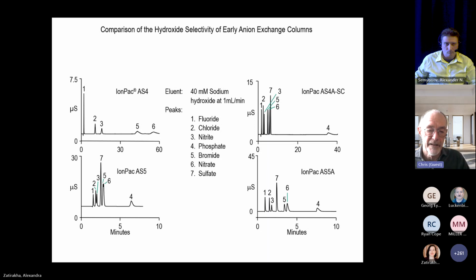And that's because those hydroxyl groups are weakly acidic, and there's an inductive effect from the quaternary site that makes them more acidic than they would otherwise be. So they have a pKa that's around 12.